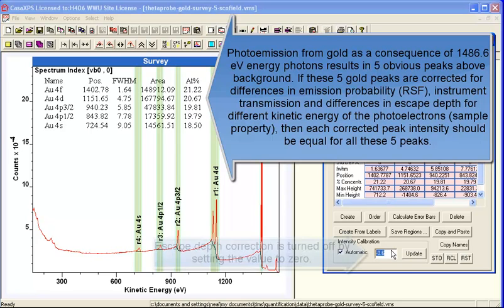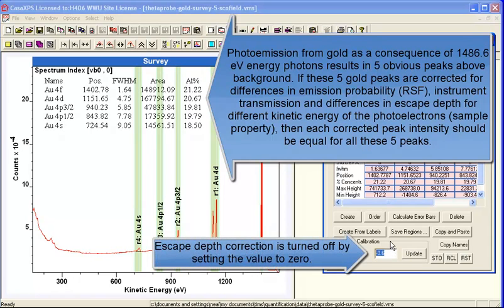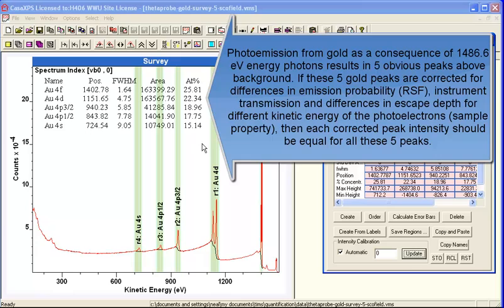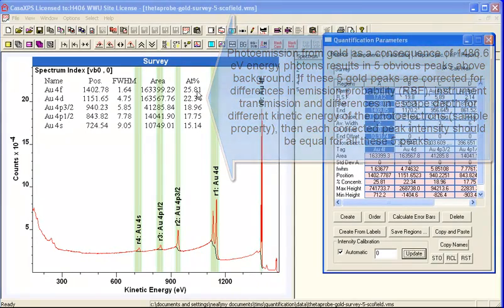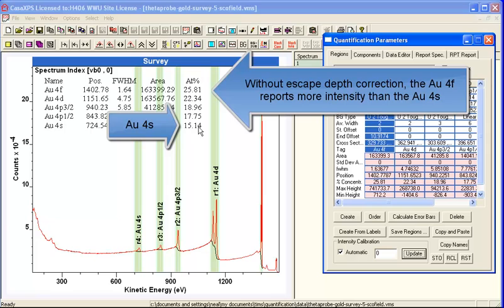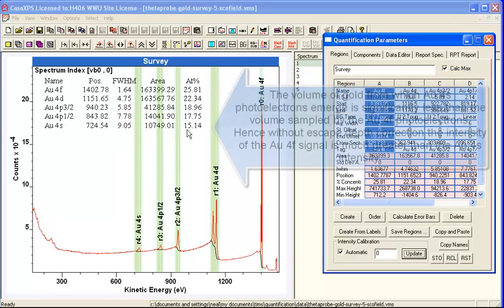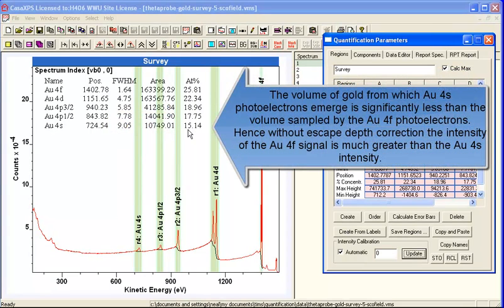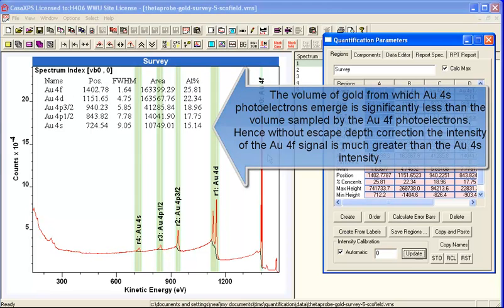If we set the escape depth to zero, that's the exponent that's set to zero, and I press update, you can see that the correction accounts for the fact that the escape depth and the number of electrons for this gold 4s will fundamentally be fewer than the 4f, simply because of this escape depth correction.